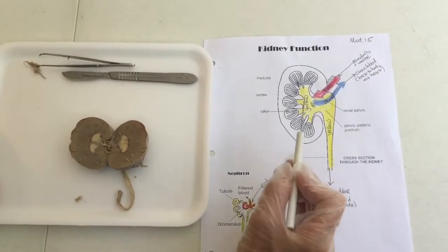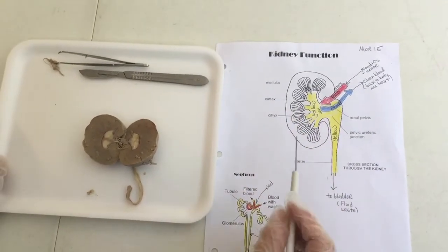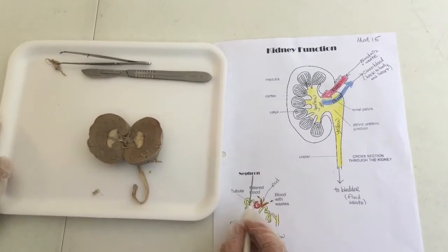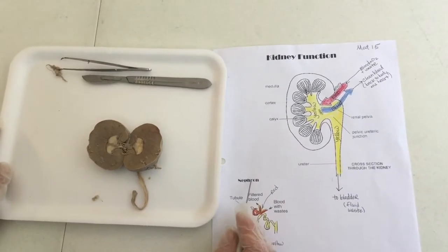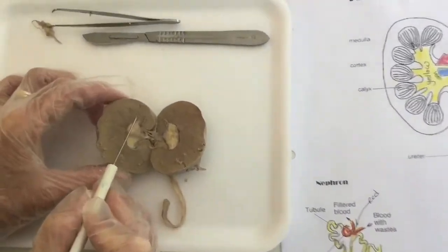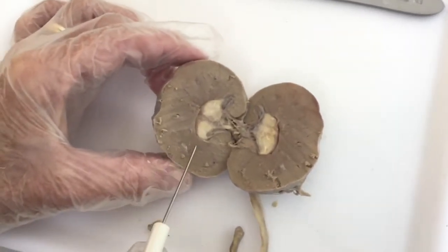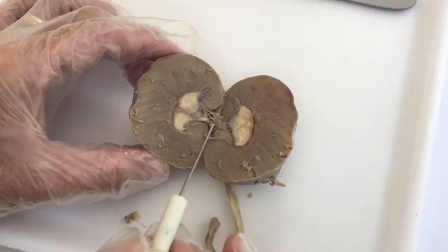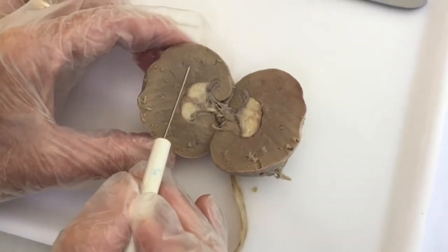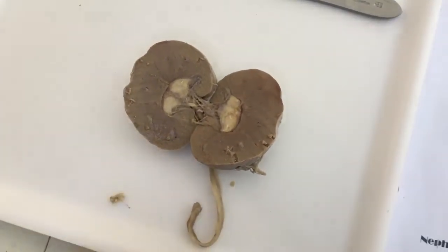Okay, now take a look at your pictures. Remember when we drew this, you saw all these filters, and I want you guys to know all the filters in here are called nephrons. Every kidney has over 1 million nephrons in this area. I don't know if you can see, you can see some lines, but it's harder to see, they're microscopic. There are over 1 million of these nephrons in this one kidney.